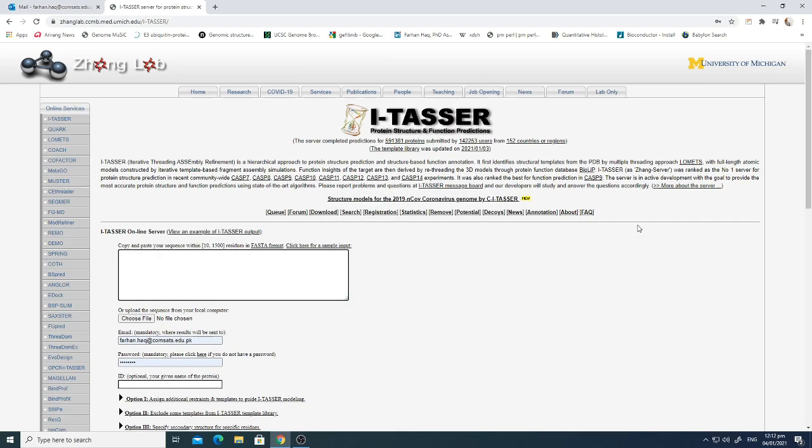Today's topic is about protein structure and function predictions using I-TASSER software. People use I-TASSER because if you do not have the right template to predict the structure of your unknown protein sequence, I-TASSER — which stands for Iterative Threading Assembly Refinement — provides a hierarchical approach to protein structure prediction and structure-based function annotation.